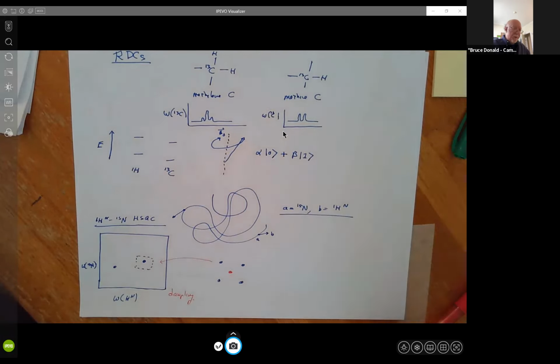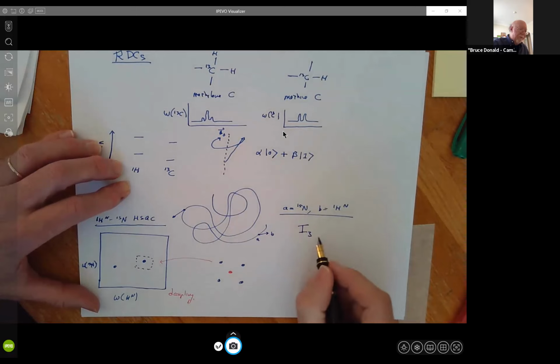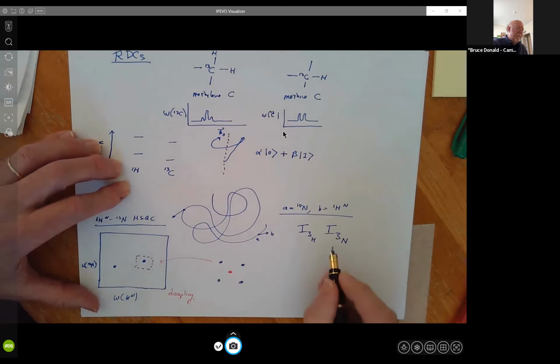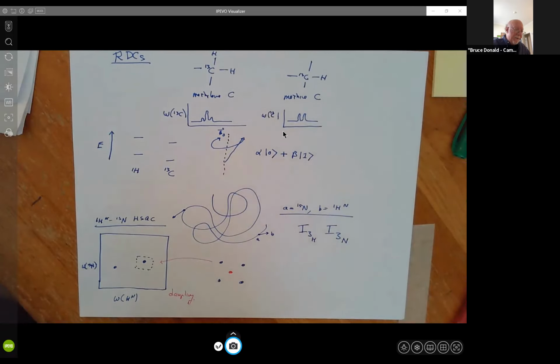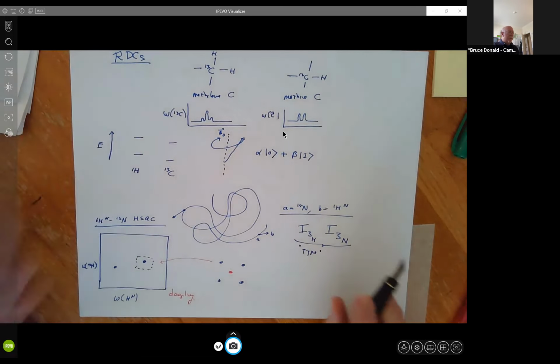And the thing it's doing is using these operators, which you can think of as these pulse sequences that move the magnetization axis. But you can think of these as operators like tipping things around the z-axis for the proton, followed by tipping things around the z-axis for the nitrogen like this. This is the sequence of operators. These are actually matrices that are multiplied together in some sense. But I want you to think about this as the quantum mechanical type of this experiment. In other words, it's manipulating the 2 spins by doing this.